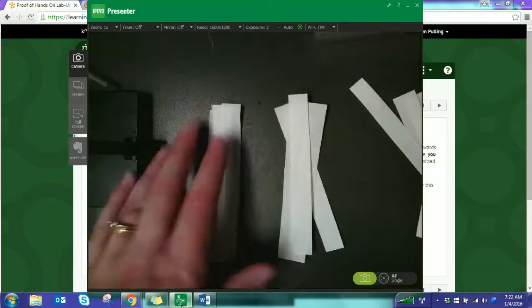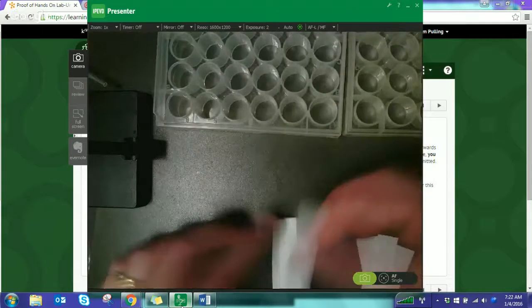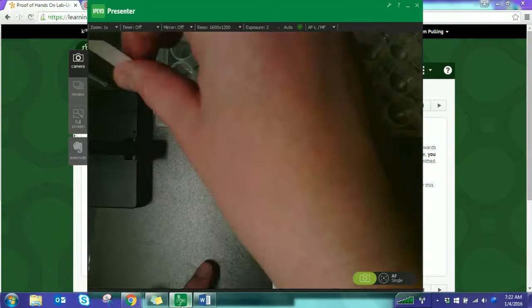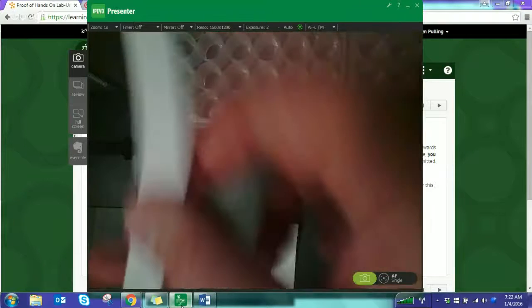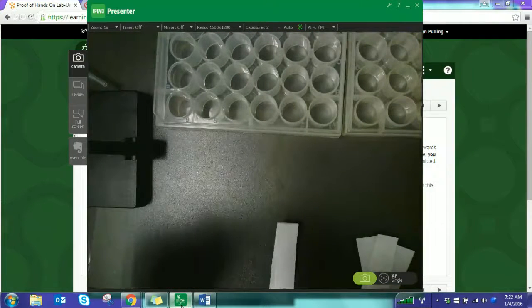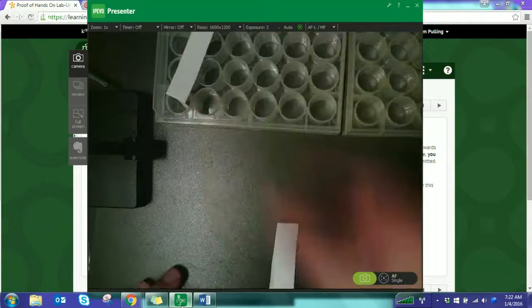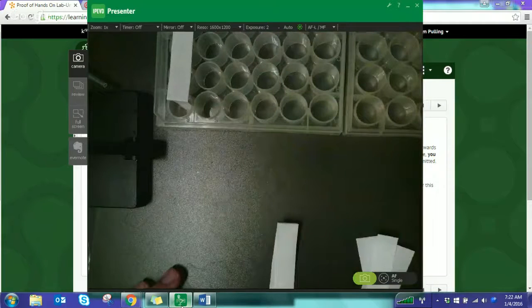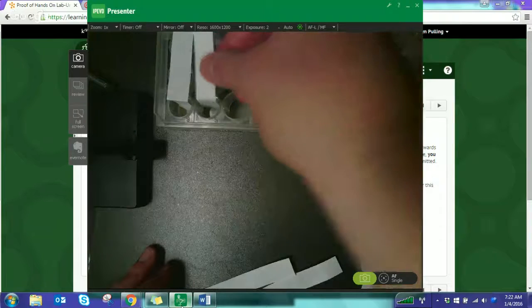One thing that they were talking about setting these up in the tray first is you're going to fold them so that they'll sit into the tray, but then hang backwards like this across the other ones. All right, so you can go ahead and get the folds set up first and then add the dot. So something kind of like that.